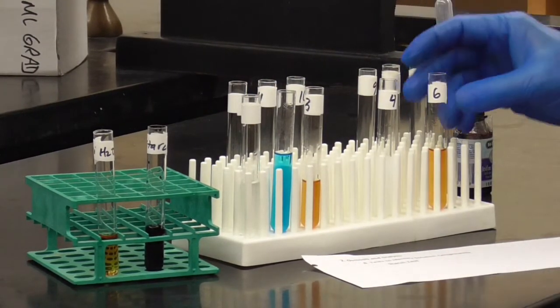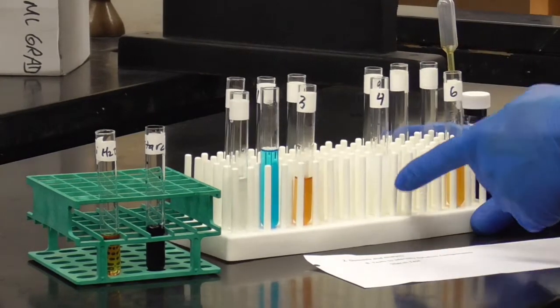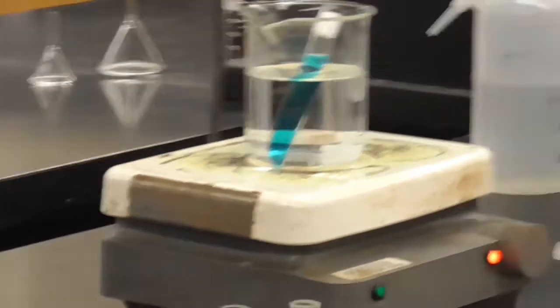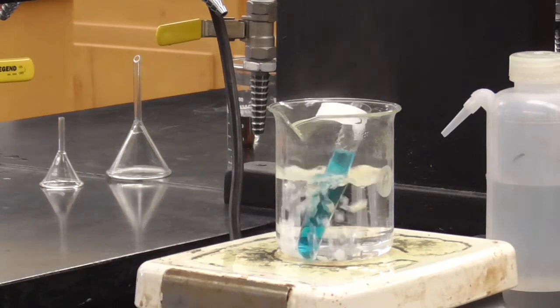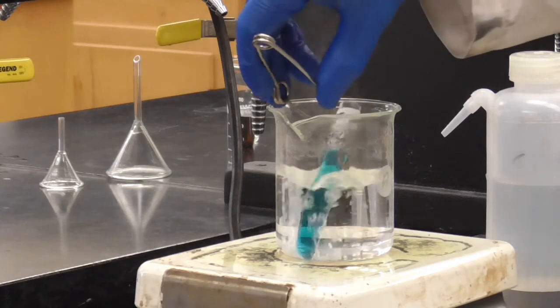So far we've got the fact that the chloride is passing, the starch is not passing, and then we need to come back over here and again wait for this to heat up and boil for 3 to 5 minutes. Okay, so it has been heating now for 5 minutes at the temperature of the boiling, and so let's go ahead and take it out of there.